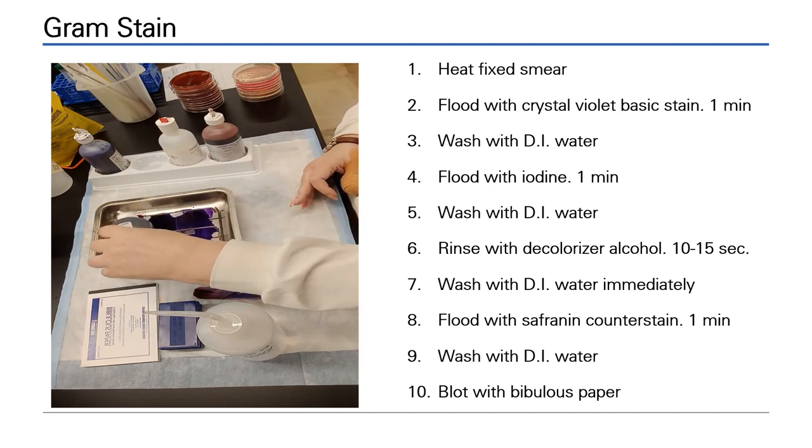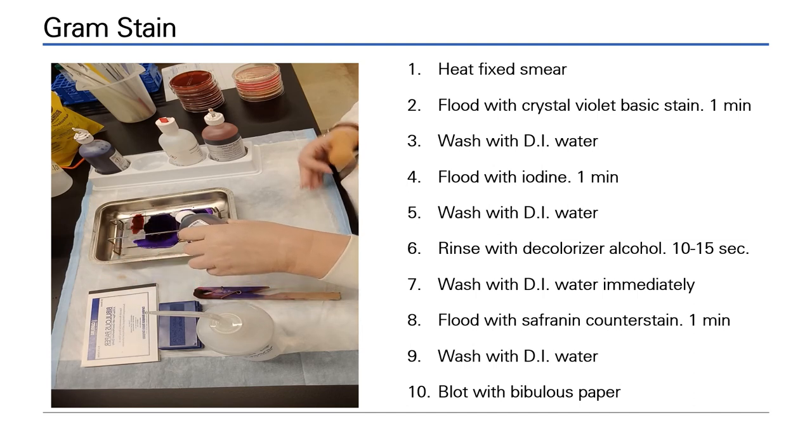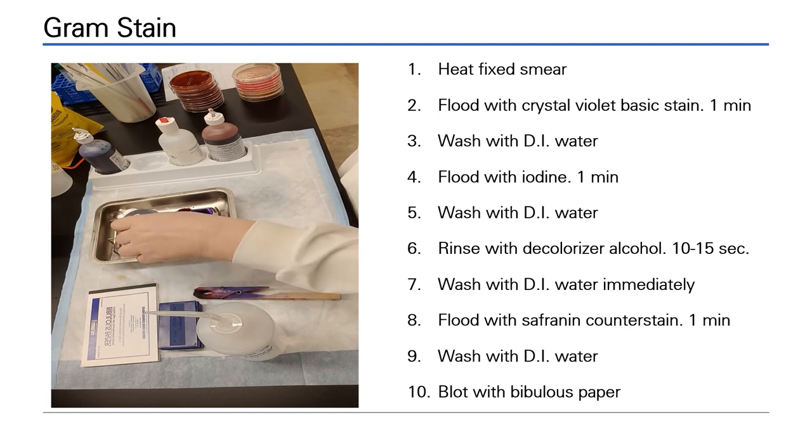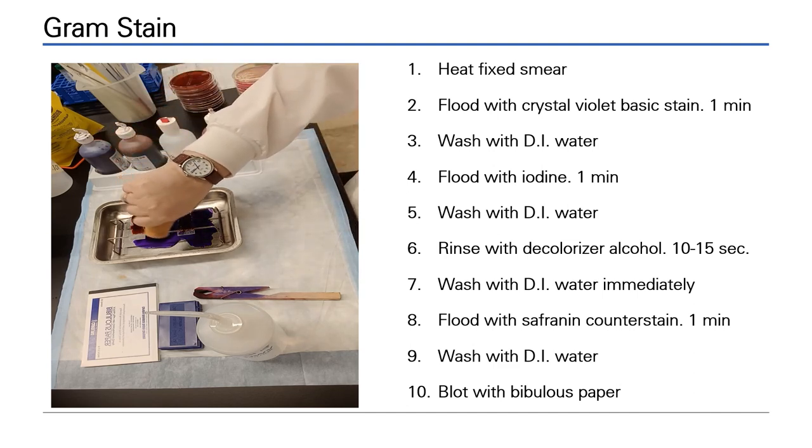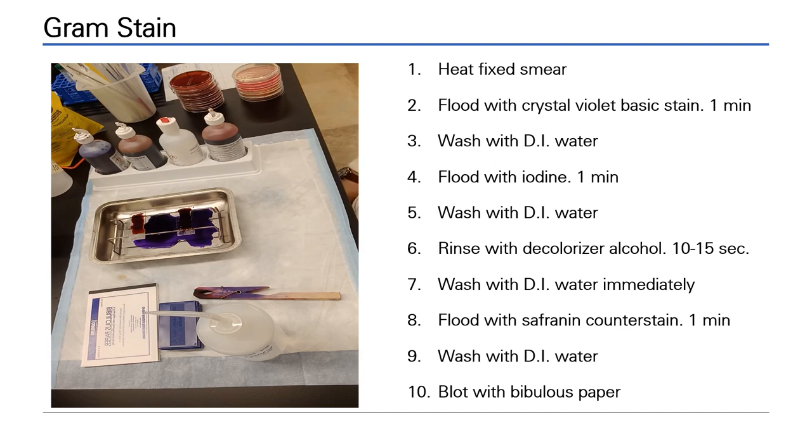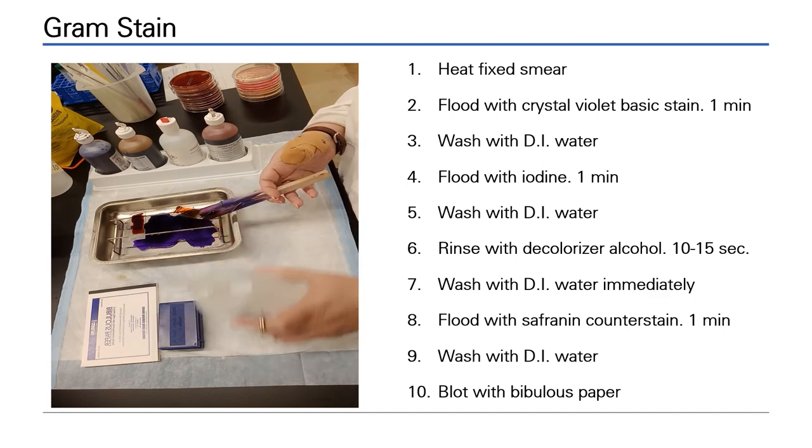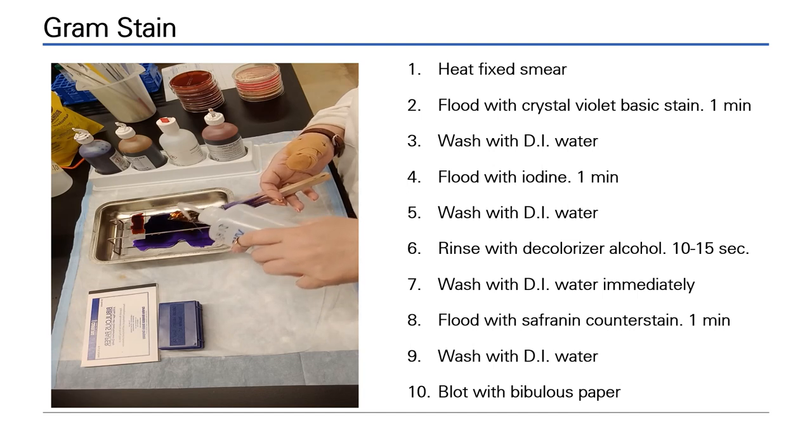Flood with iodine. Make sure that the entire specimen is always covered. Wait for a minute to stain. During this time, the iodine is also entering the cell wall and binding with the crystal violet making the first basic crystal violet stain less soluble. Again, carefully lift the slides. Angle them for washing. Always use a gentle flow of water.